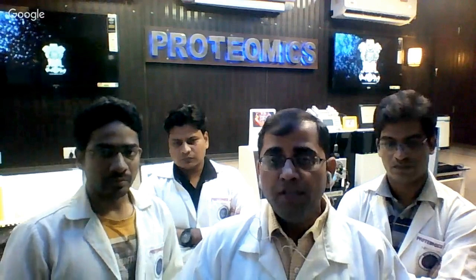So today, we thought to take you to one part of the lab which is focused on mass spectrometry based proteomics, and give you a live demo of how to use these latest technologies. As you go along in the course, you will learn what an important role mass spectrometry has played in proteomics. I must say that mass spectrometers have revolutionized the whole of the proteomics field. The way we were thinking about doing proteomics has totally changed with the innovations and latest technology advancements.